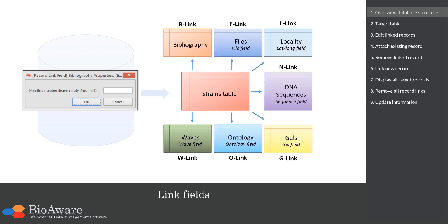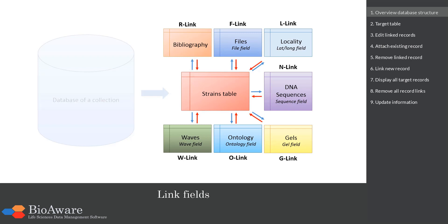For all types of link fields we have the option to give the maximum number of links. For example, when you do not want to link more than one article to a strain, then you set the maximum number to 1. Reverse links can be created automatically. For example, in the strains table you can see the linked bibliography records, but in the bibliography table you can also see the linked strains records.